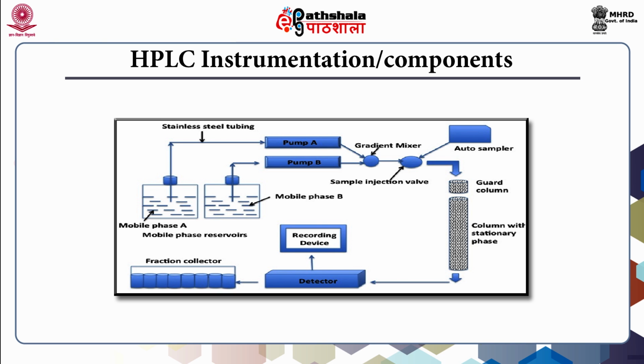So, let us discuss all these components of the HPLC instrument one by one. Let us start with the mobile phase.